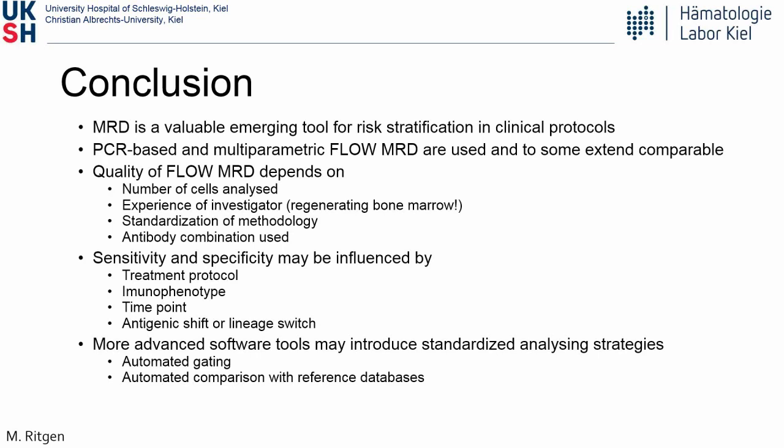And also, more specifically back to one of your slides where you were comparing the different techniques. You also showed that the flow-based MRD is applicable in 95% of cases compared to 90% by PCR. And I see that someone wanted further comments on that. I'm guessing it's probably around why you're saying 95 and 90 for PCR, which is why this question is coming in.